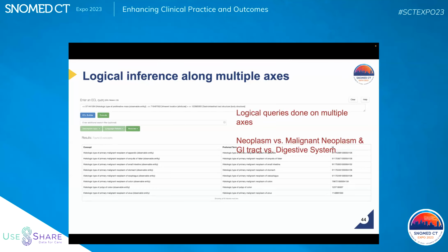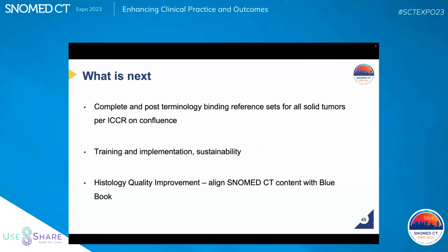Now, this is just querying terminology, right? So, yeah, this is querying SNOMED and getting SNOMED responses. But in the production database, what you're basically getting is your inclusion criteria. And when you get your inclusion criteria, then they're associated with your encoded data. Now you're bringing your patient level information forward. So that's really important and really the important aspect here.